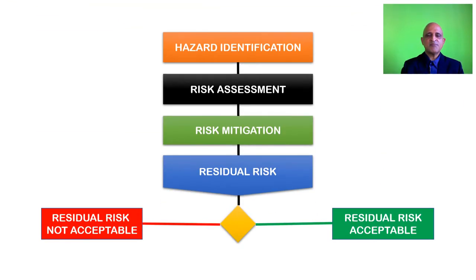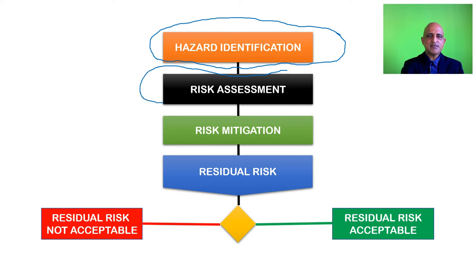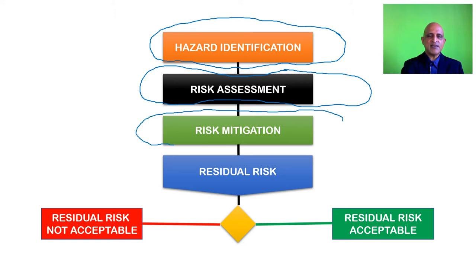Let us look back briefly on the description of the flow. We commence with hazard identification — we identify the hazards. We then conduct a risk assessment and categorize our biological agent into the respective risk group. We also conduct a risk assessment using a risk matrix as was discussed earlier. We then move on to risk mitigation, and this is where the controls come into the picture.